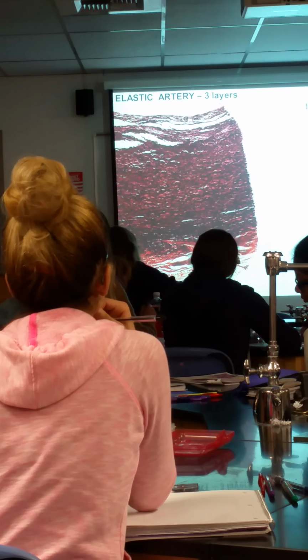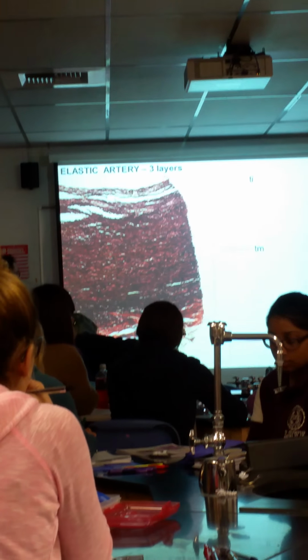The elastic arteries are the largest arteries. In fact, they're so large that under low magnification you can barely get the entire thing in the field of view. And notice the colors. In the TI, we don't notice anything. I can only point to it. It's the innermost layer.